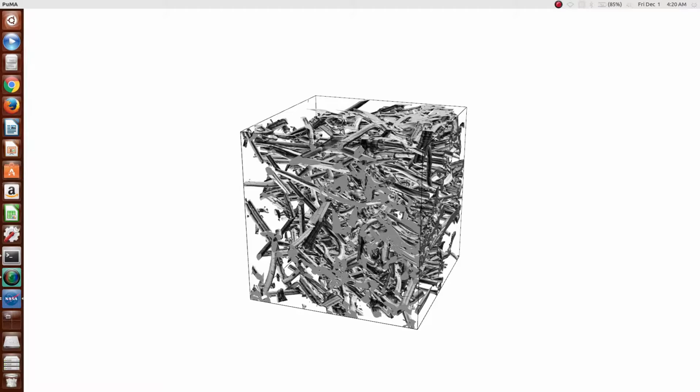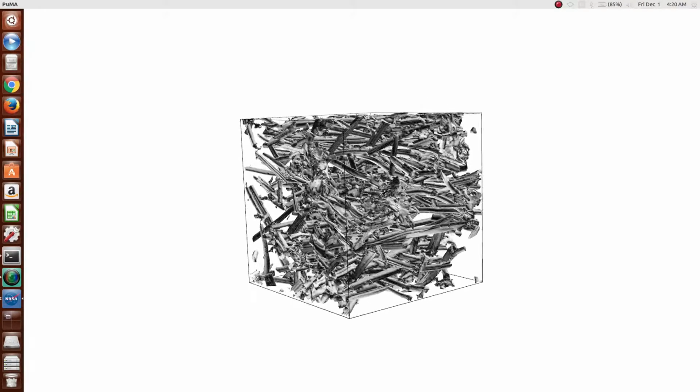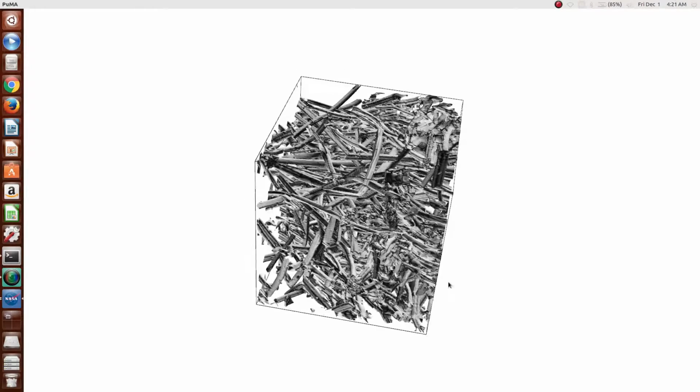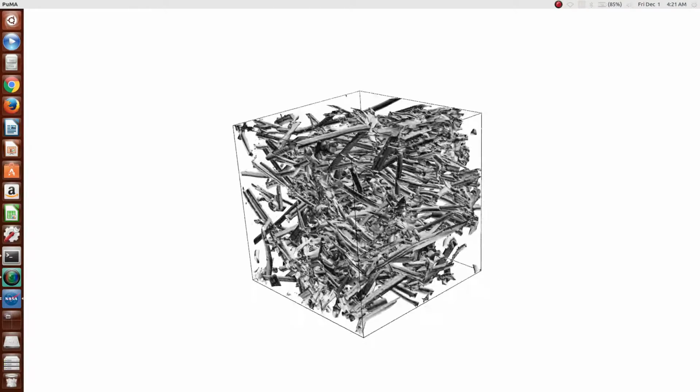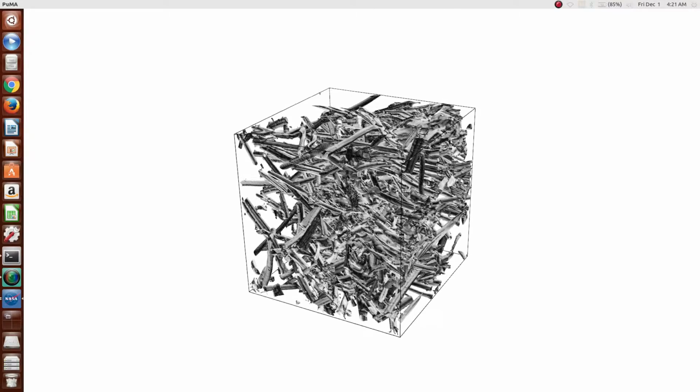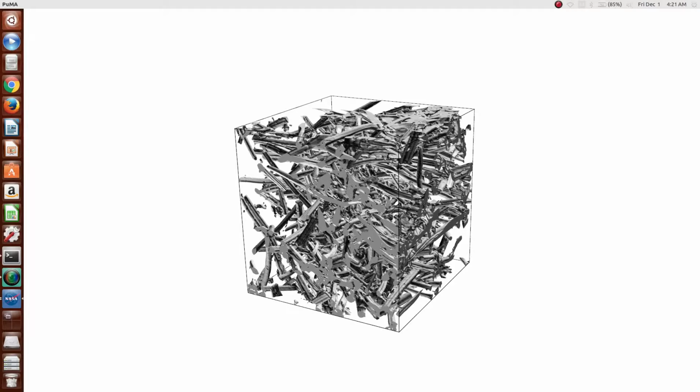In order to rotate the 3D image on a typical mouse with two buttons and a scroll wheel, click the left button and rotate the image by moving the mouse around. As you can see, while it's rotating, the sample has been downgraded. That's so that the visualization remains smooth. Once you let go, it will render the full image again.